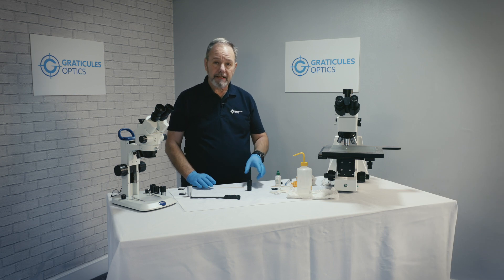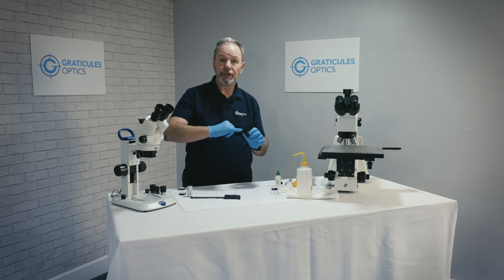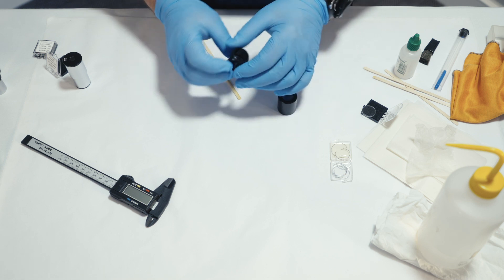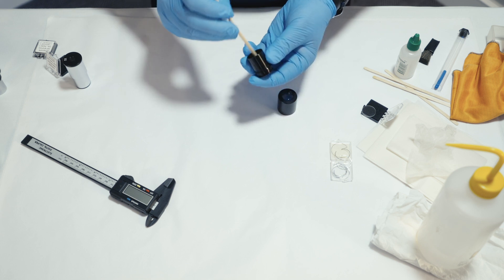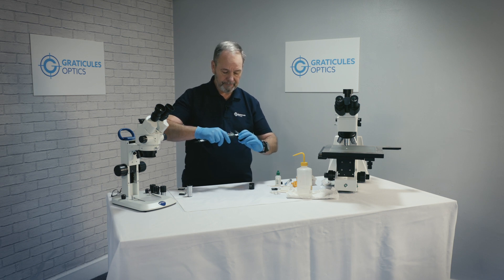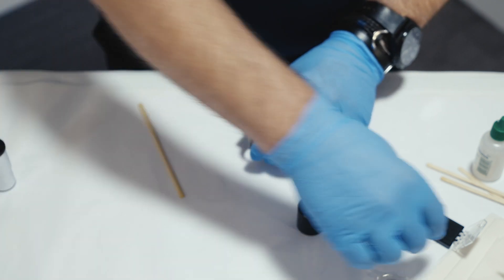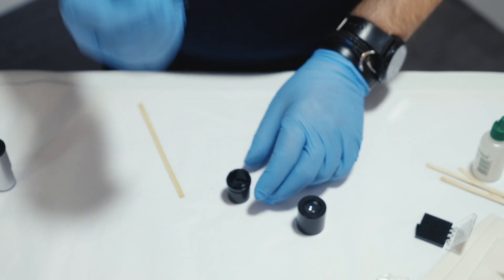This is our second eyepiece, the Ramsden type. It's a little simpler as we have an open tube below the lens and a shelf where to mount the reticle, accessed from here. What we need to do is measure the inner tube first — zero our micrometer and measure to the shelf. This one reads about 20, 20 and a half millimeters. So this 20 millimeter reticle will fit into the shelf quite nicely.